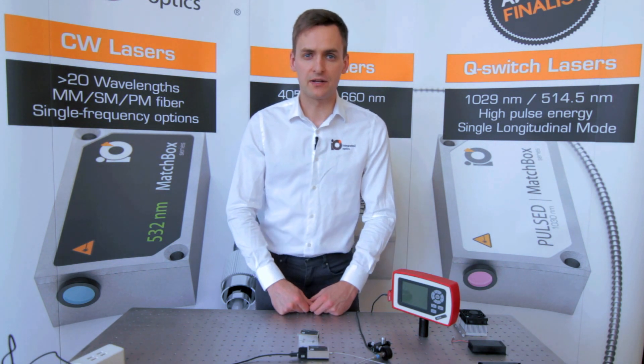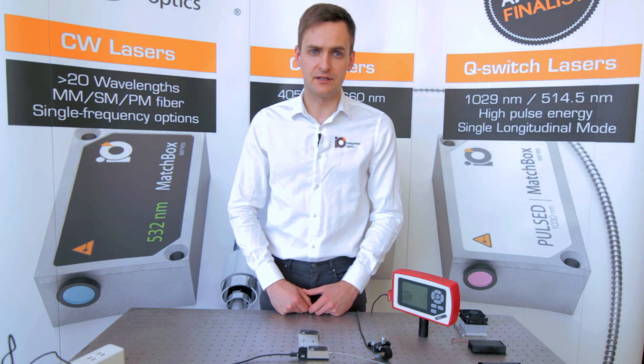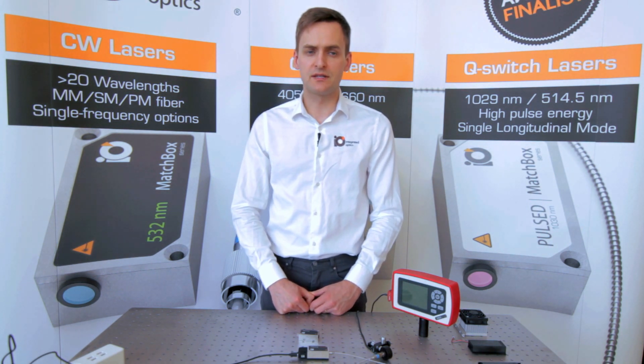There are many ranges of CW lasers for spectroscopy applications. Historically, several form factors were established in the market and all laser manufacturers were trying to follow these form factor and control interface peculiarities. Nevertheless, choosing and adapting a range of CW lasers is always a challenge.